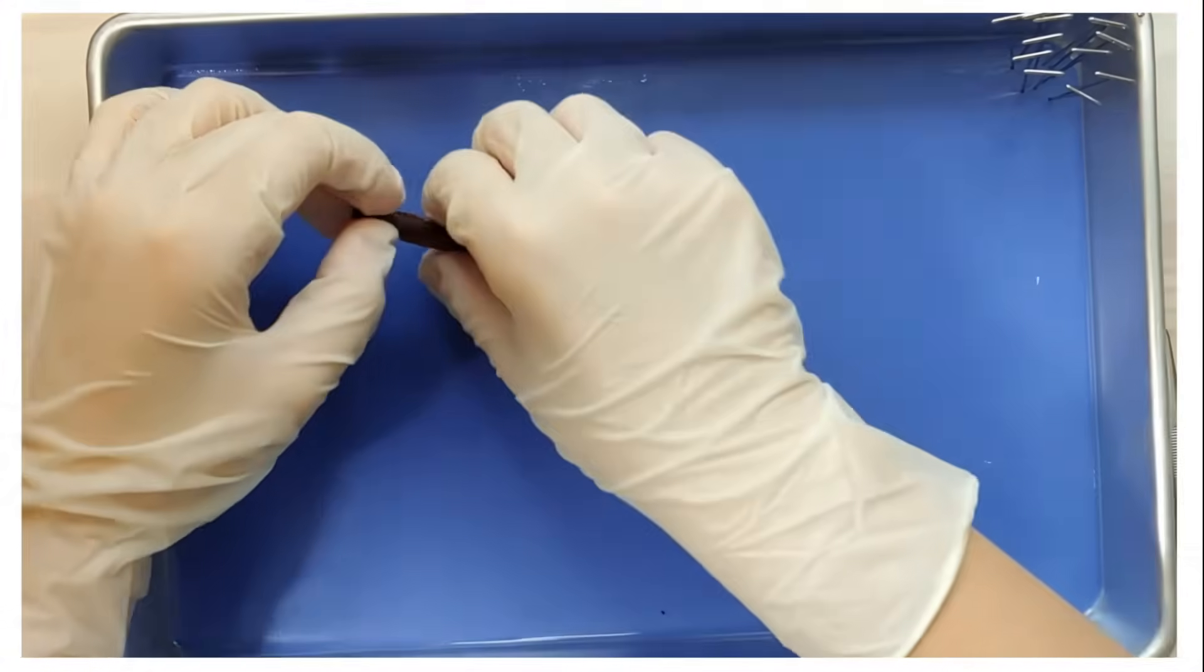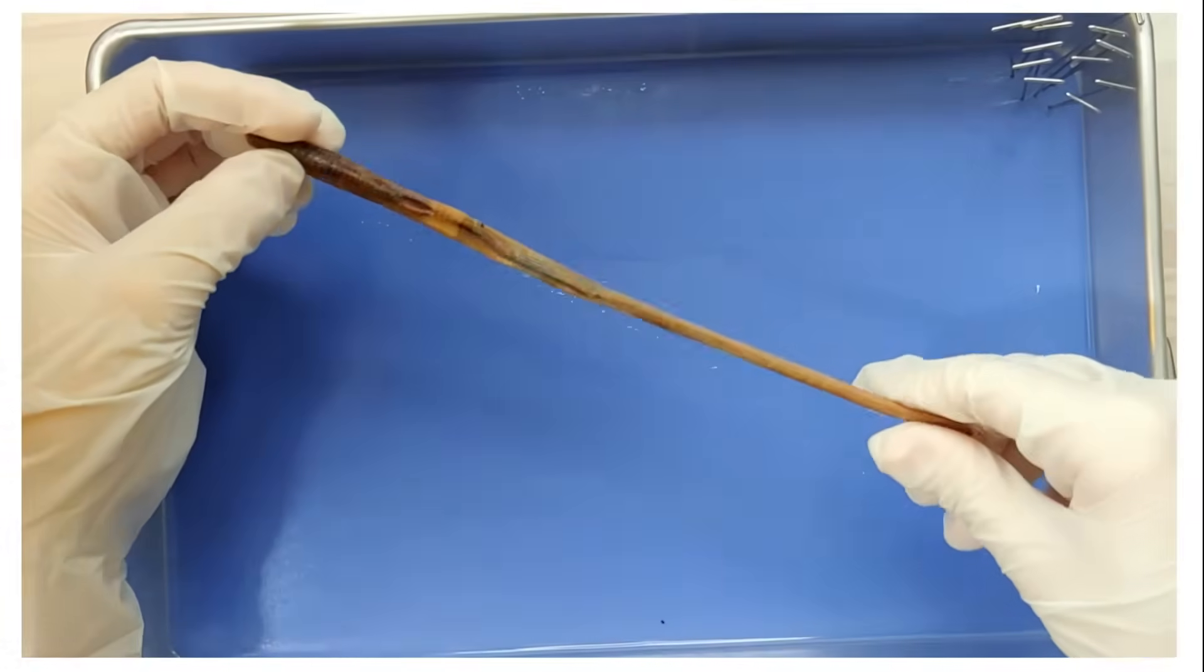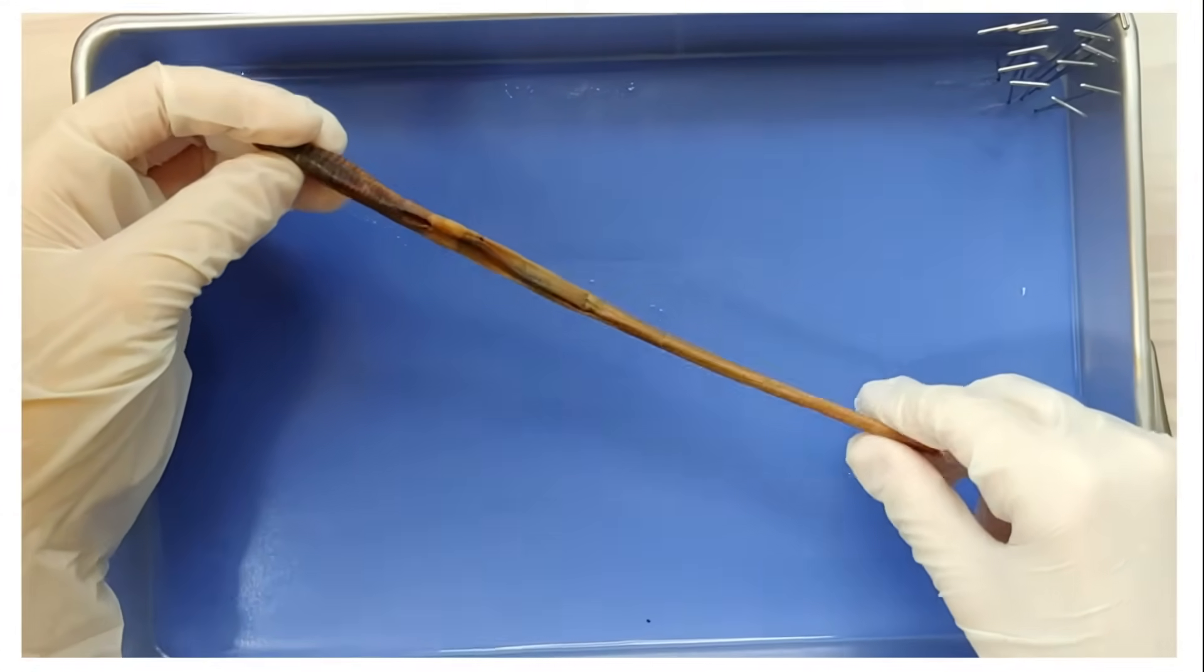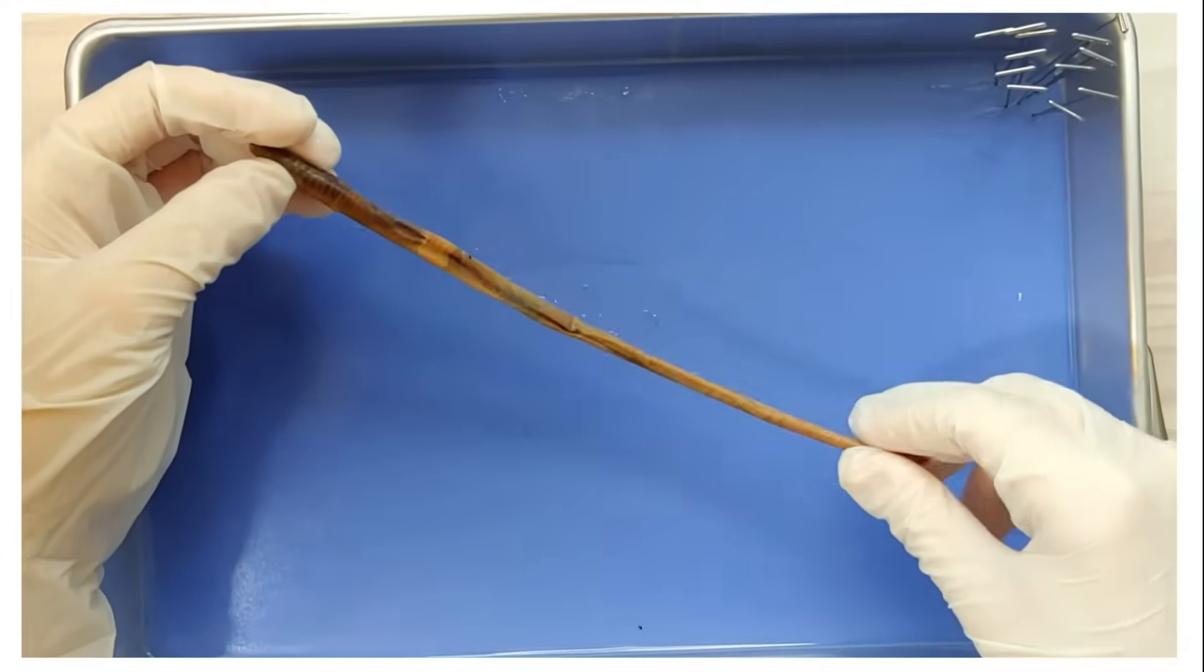So this is the ventral side or the stomach and that is the dorsal side or the back. You can see that the dorsal side is darker than the ventral side.